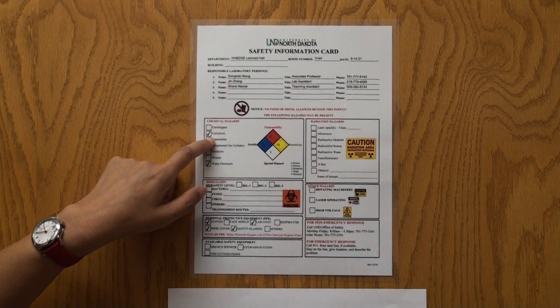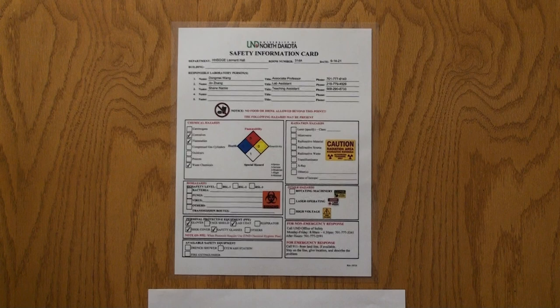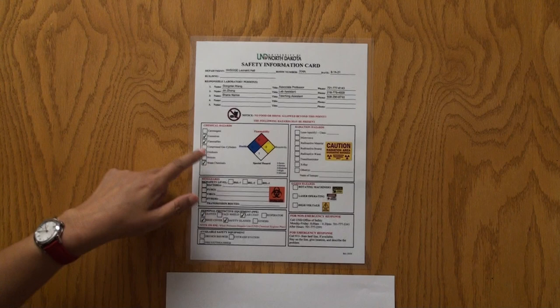Again, it's not really harmful. You can see the level only one, and it's saying we want to put that solvent, for example solvent like toluene, into the hood, and we do have waste chemicals.